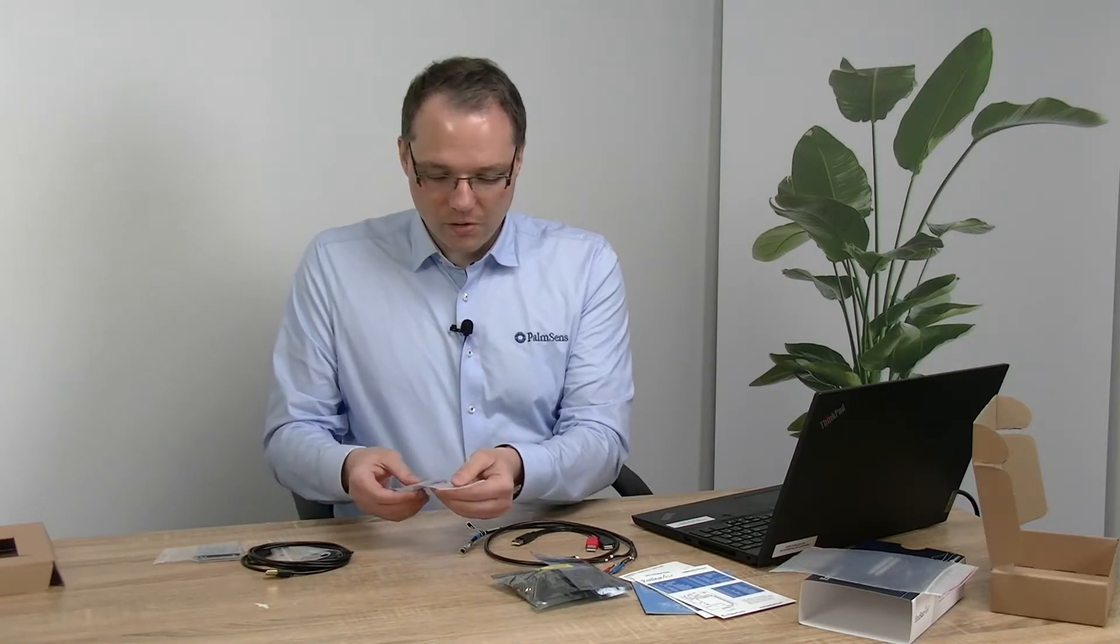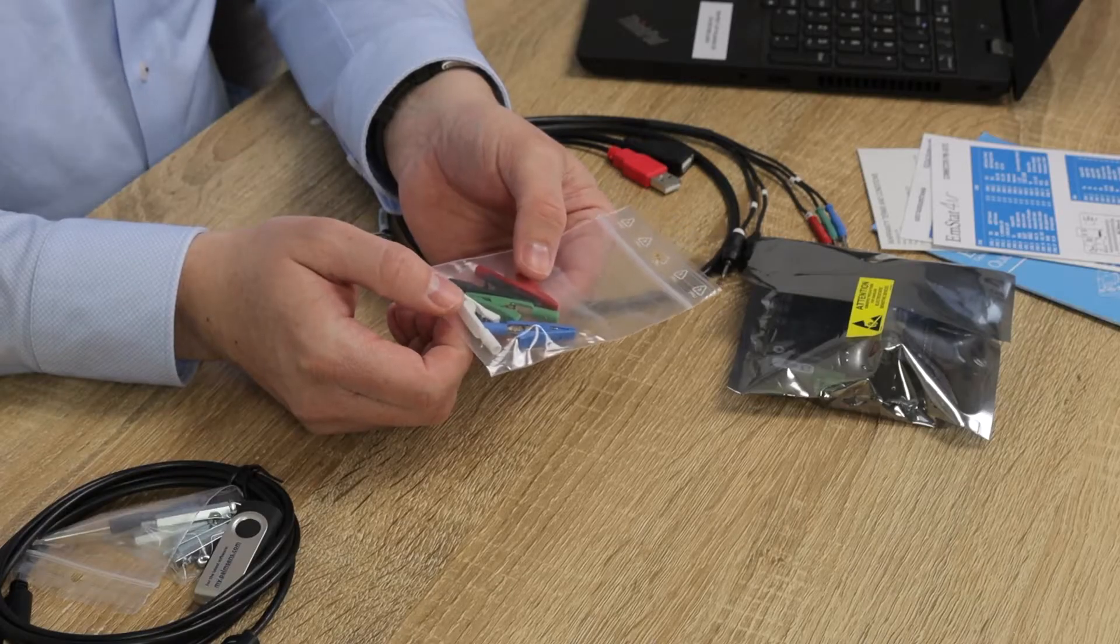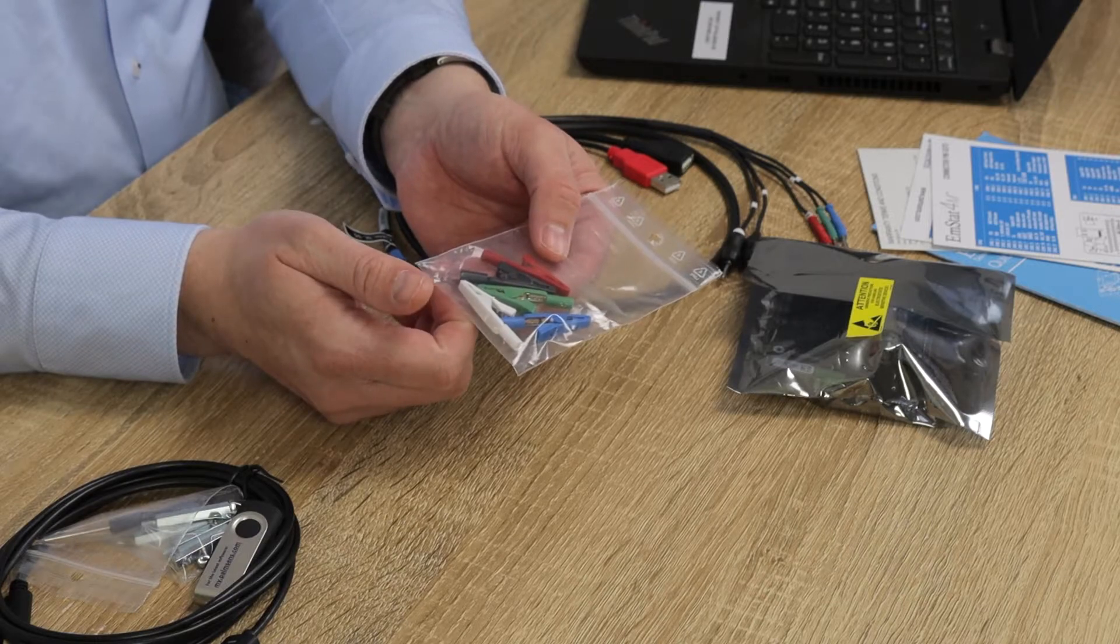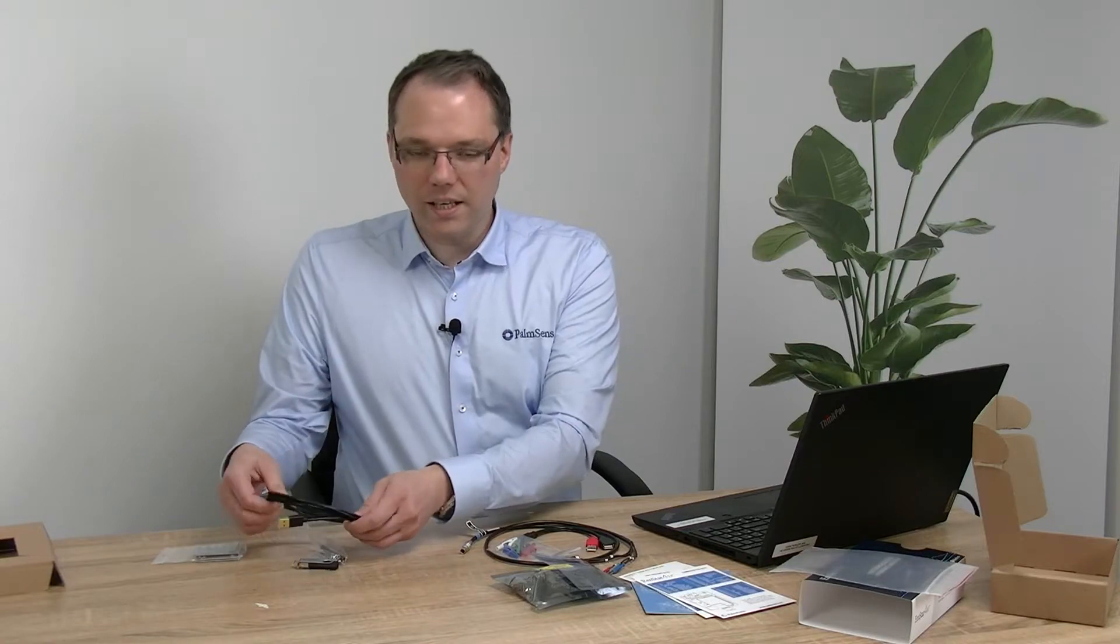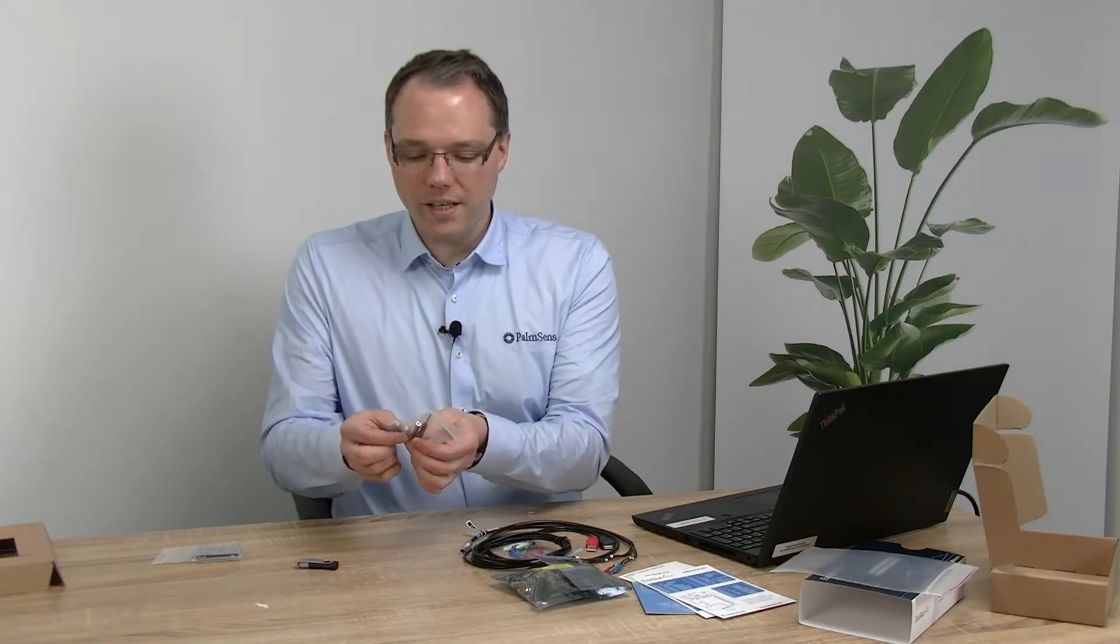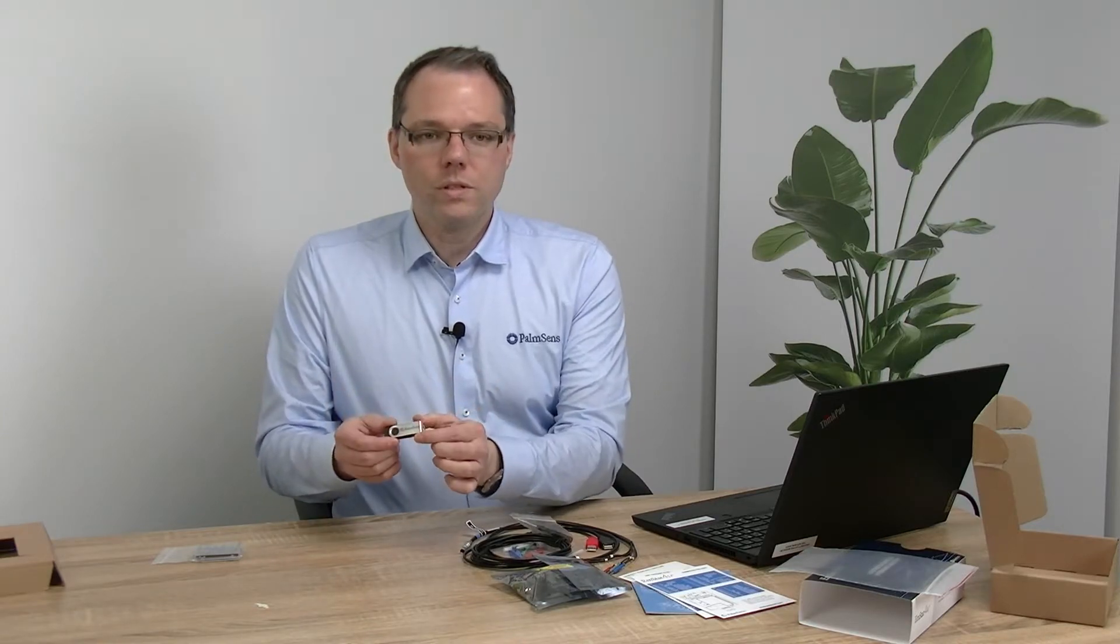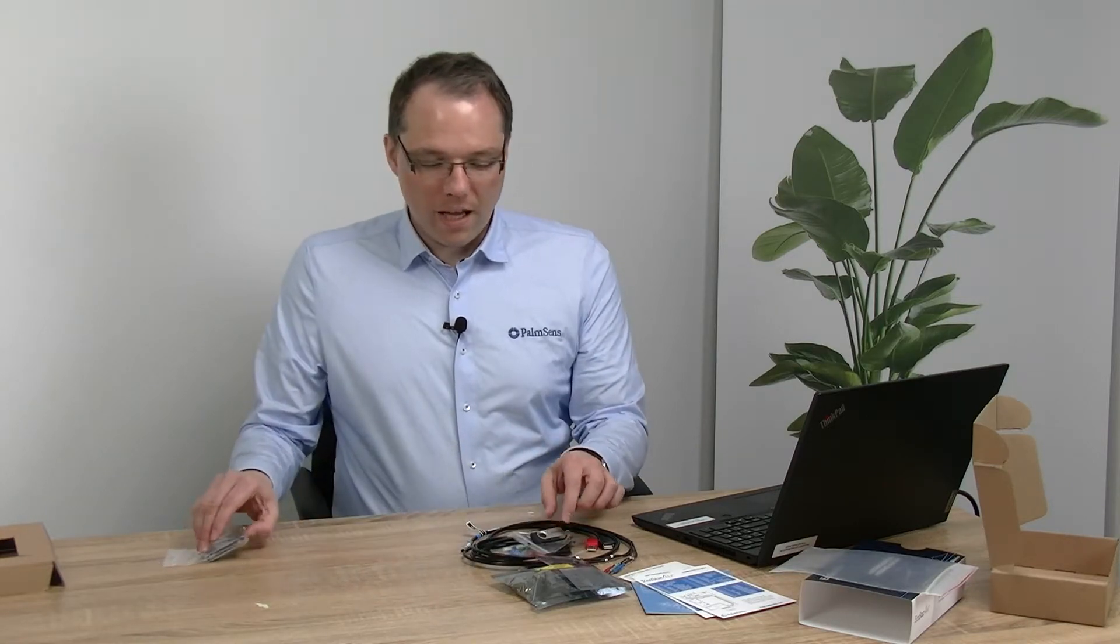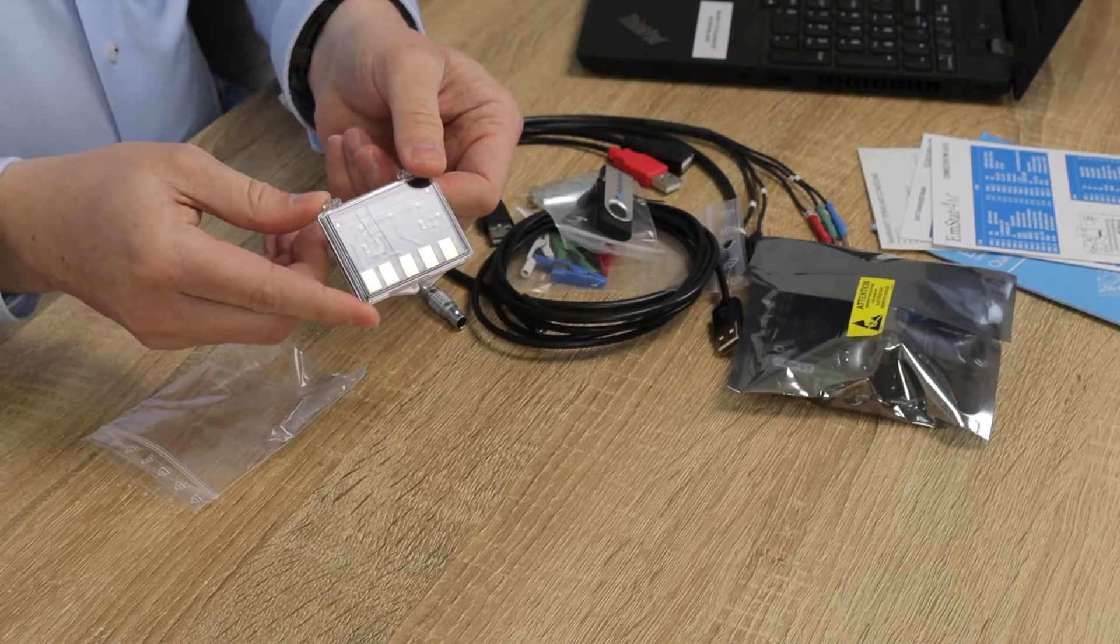Then to connect your sensors or electrodes you also have here crocodile clips so you can clip your electrodes to almost every electrode. We have a USB cable to connect the board for communication. We have a mini screwdriver and some legs for the development board. We have a USB stick in case you're too impatient and you don't want to wait for a download. And this is what we're going to use for a test measurement—we have a dummy cell here that has three different test circuits.